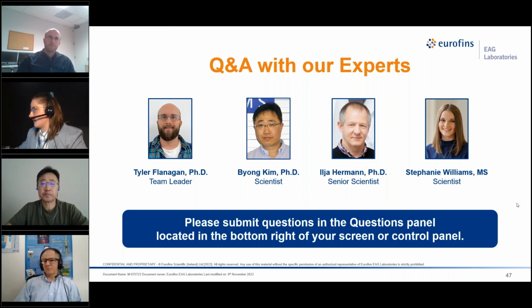And with that, I'm going to ask our last question. Actually, we have one or two more questions. What effect does humidity play in the collection of AFM data?